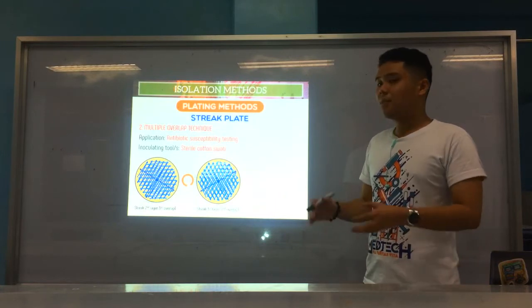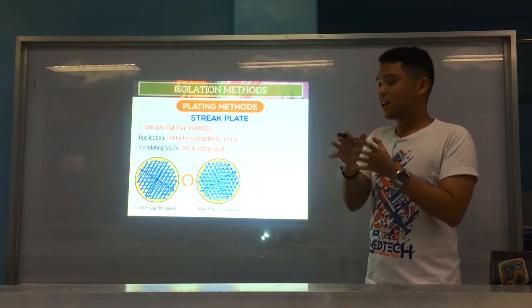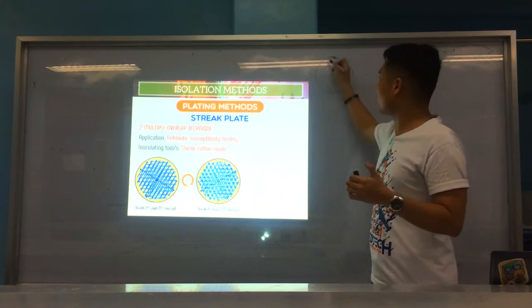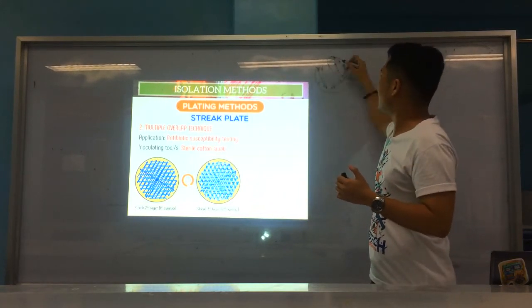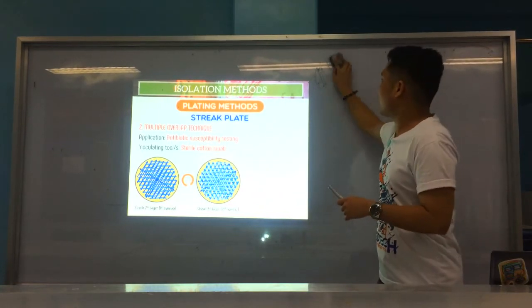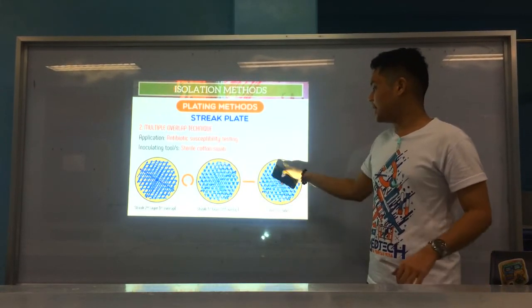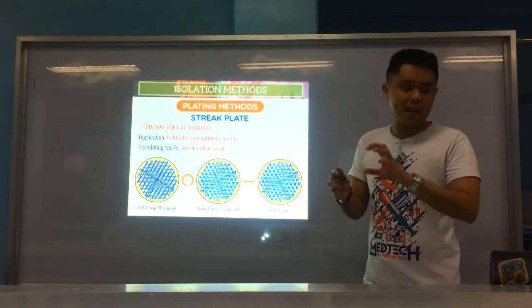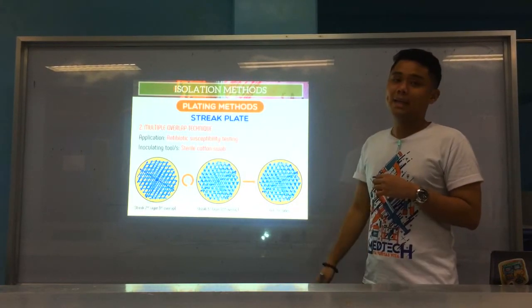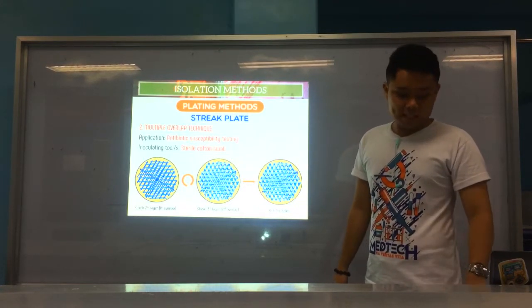So meaning, basically the colonies overlap, or the streaks overlap. Because again, what you want to have is a lawn. Like, the plate is full of growth, thick growth. Because again, you want to test for antibiotic susceptibility. Okay? Alright. And after the third quadrant, or the third layer, you rim the sides. That will ensure that bacteria grow on the sides and cover the whole culture media plate. Okay? And that's for your multiple overlap. Where is it used? That's for antimicrobial susceptibility testing.